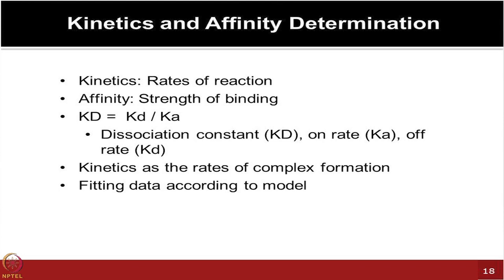But what it's offering you, of course, is much more powerful information. As we talked, you are getting the kinetics or the rate of reaction, which you can monitor in a label free and real time manner. You are looking at both the on rate and off rate of these reactions, unlike the label based methods where you are just saying whether binding is happening or not happening. Here you are saying that okay, binding is happening, but probably the on rate was very fast or the off rate was very slow. So those kinds of information you can obtain.